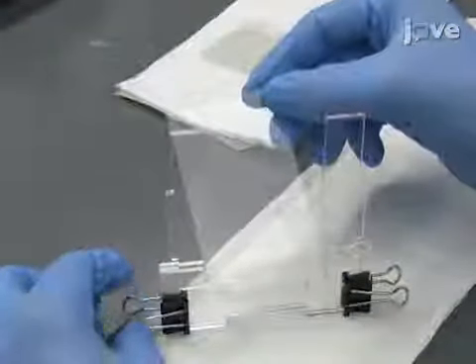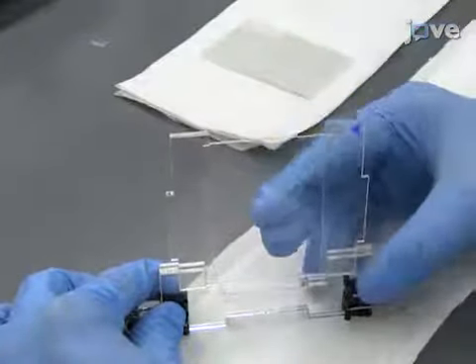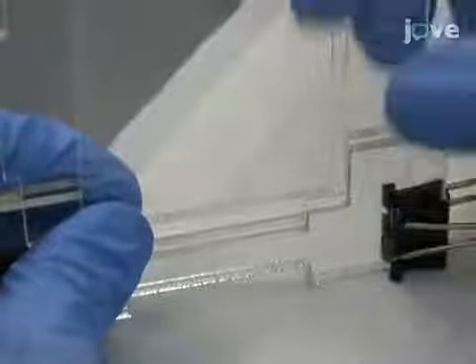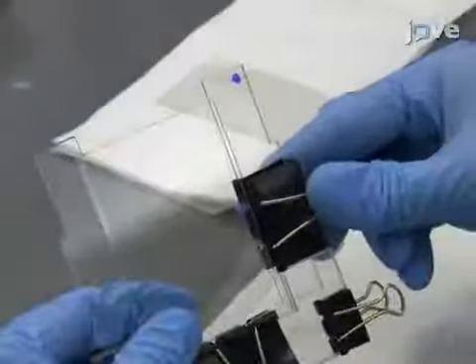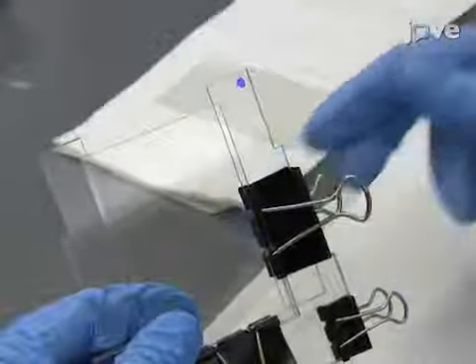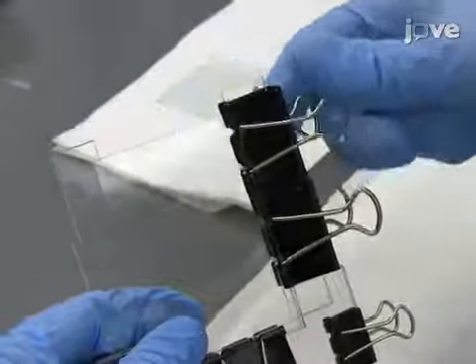Place a cleaned and dried glass slide on the mold and hold it in place while placing a second glass slide on the other side. Clamp the assembly with a larger binder clip. Clamp down both slides with larger binder clips, making sure each upper binder clip is in contact with the glass slide overlapping the acrylic.